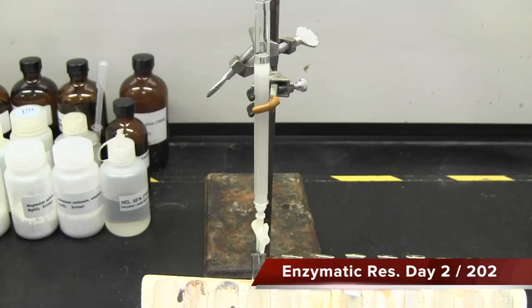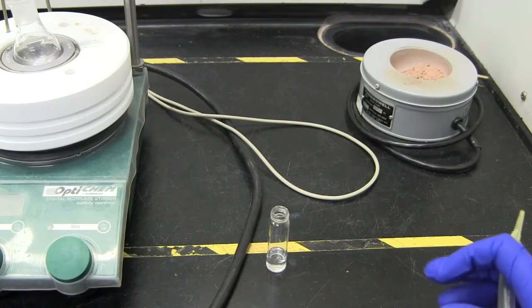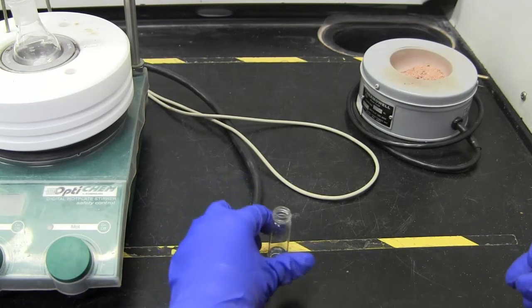In this half of the lab, you will separate your mixture using a silica gel column. First, evaporate the solvent. This can be done with nitrogen.